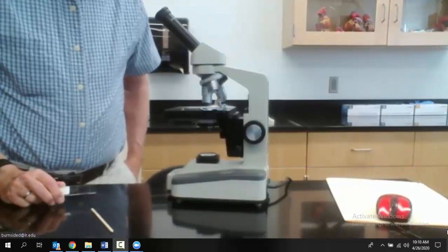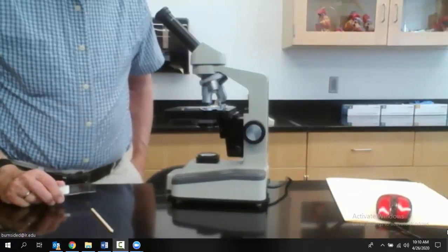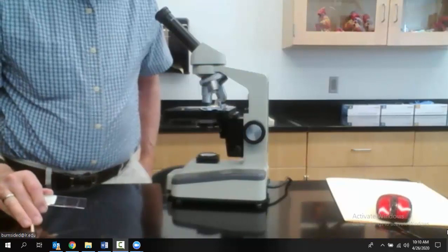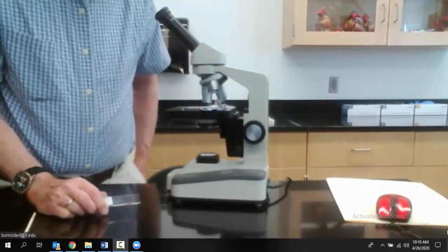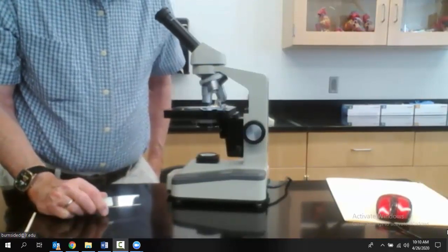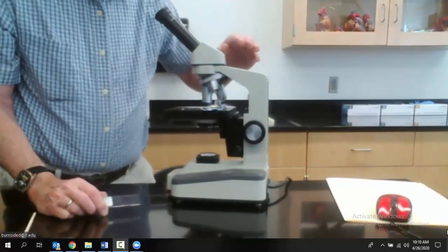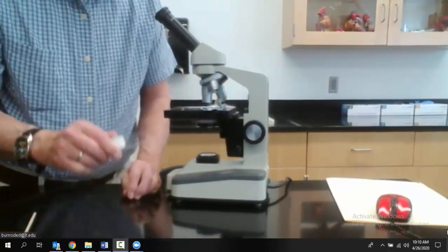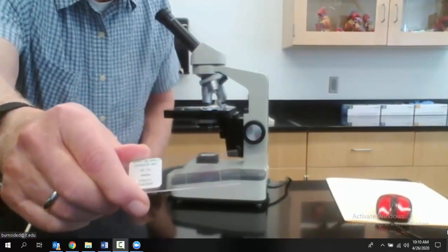In this video, we're going to talk a little bit about histology. Histology is the study of tissue, which is a group of cells functioning together and having similar structure. In order to see the tissue, we have to have a microscope, and then we take a section of that tissue and put it on a microscope slide.